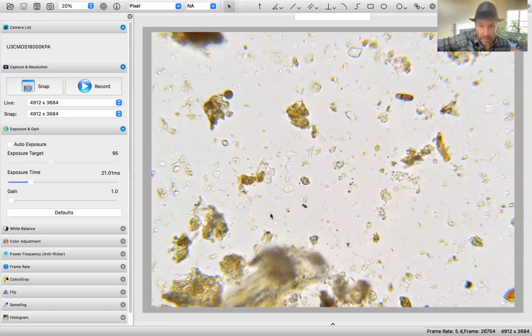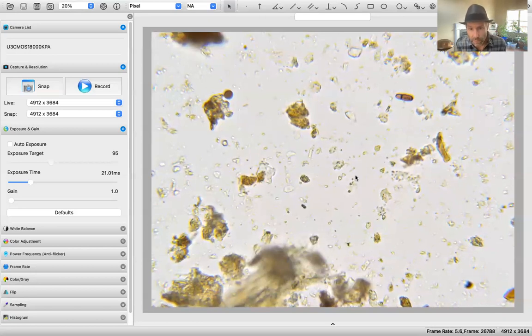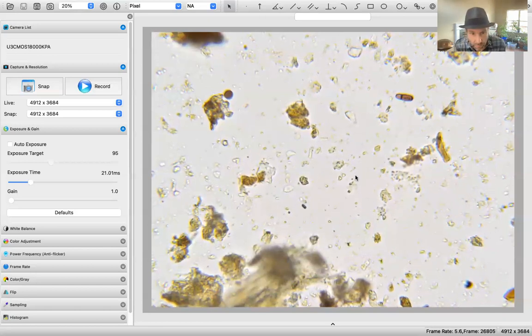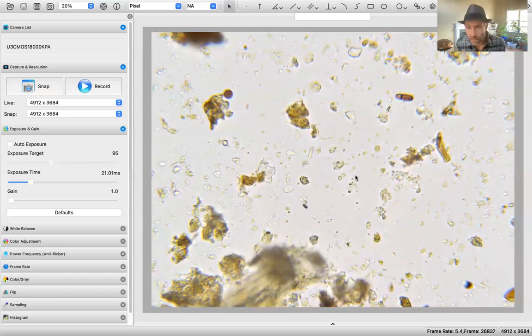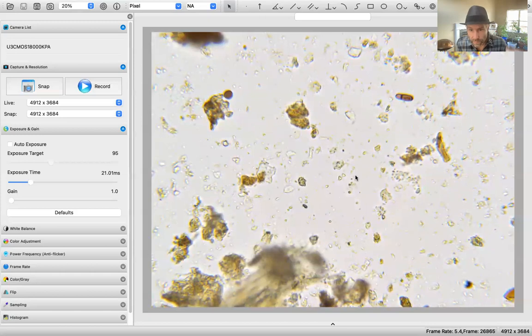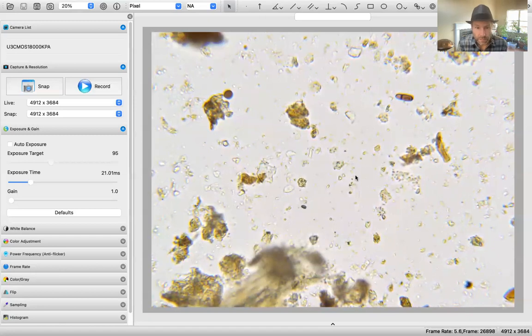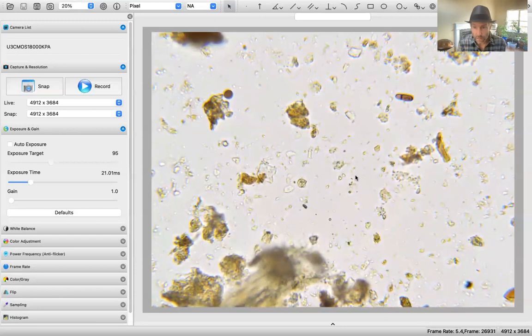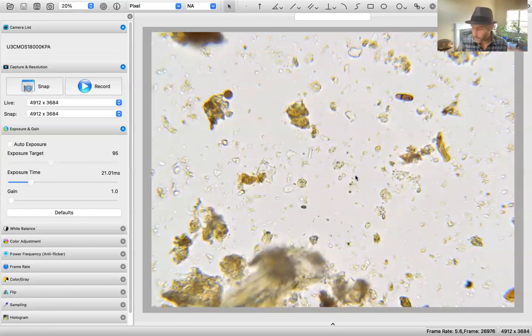Oh, there looks like a budding spore right here, possibly a Basidiomycota. Don't see any flagellates. No flagellates or testates that are popping out. And no fungi appears to be in the frame, which is not good because we need all of our members, or at least 3 of them, in the first reading area. So this worries me a bit. I hope I'm not wasting my time here.